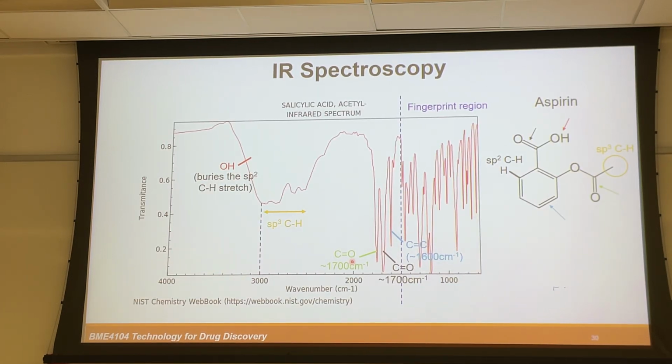That's also the most characteristic one. So for your assignments and exams, you only need to concern yourself with those most featured functional groups. So to summarize, if, for example, in your experiment you did IR spectroscopy analysis, and for your compound, this is the spectrum that you get. So how should you read it?